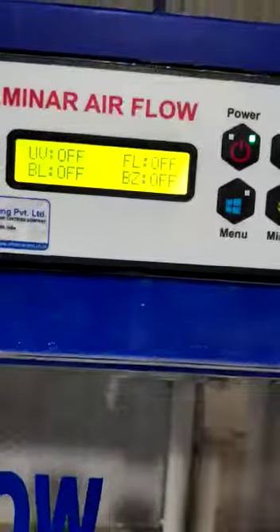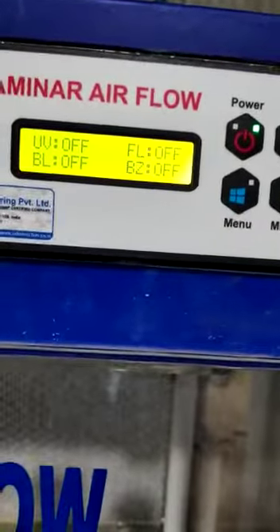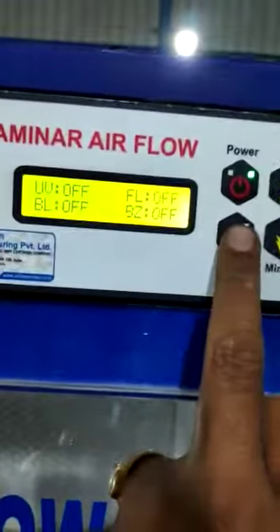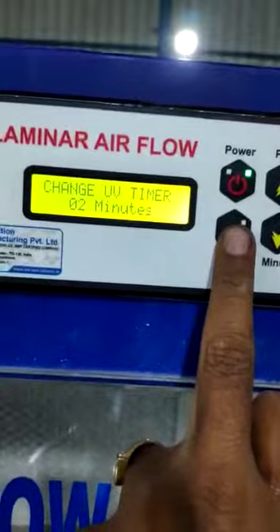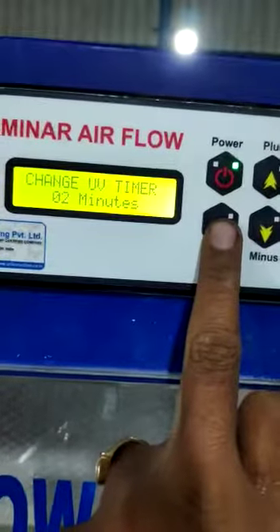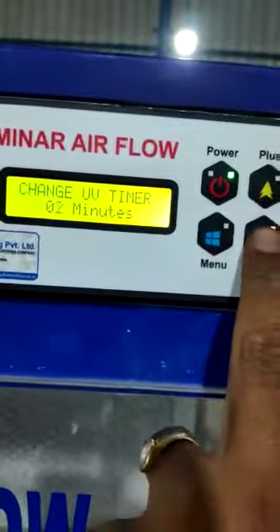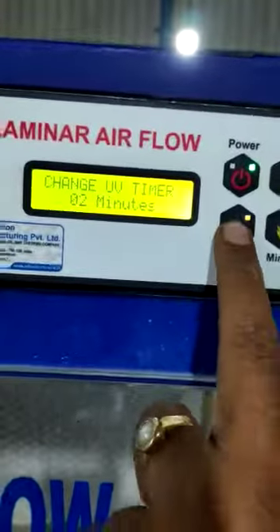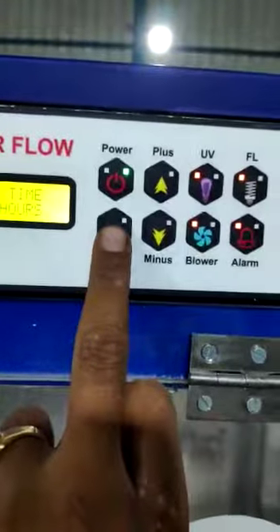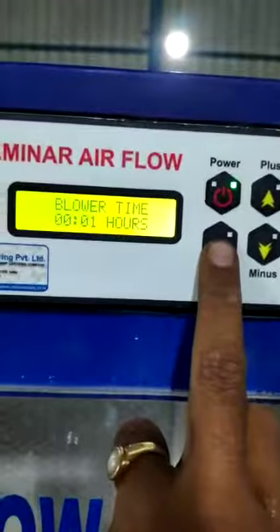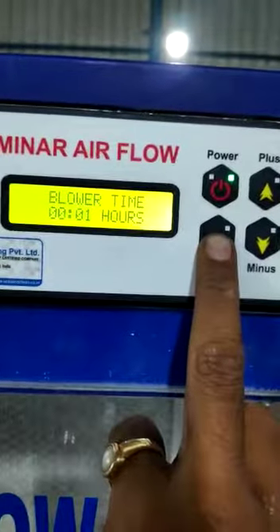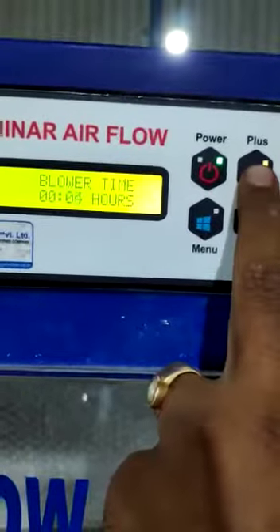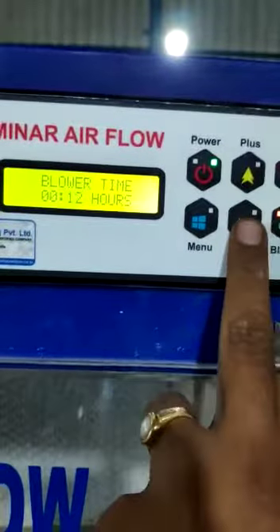First it shows UV hours. Now if you want to go to the control panel, press this menu button. This is the UV timer — after 2 minutes UV will stop. You can increase or decrease. This is blower timing — after 1 minute blower will off. You can increase or decrease.